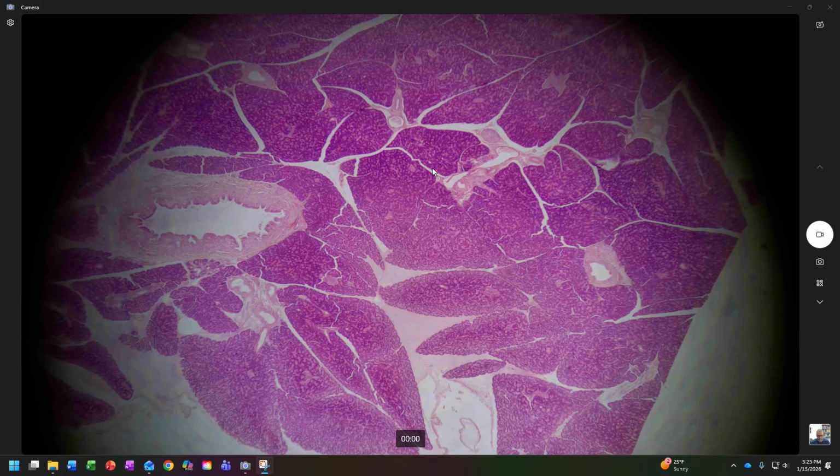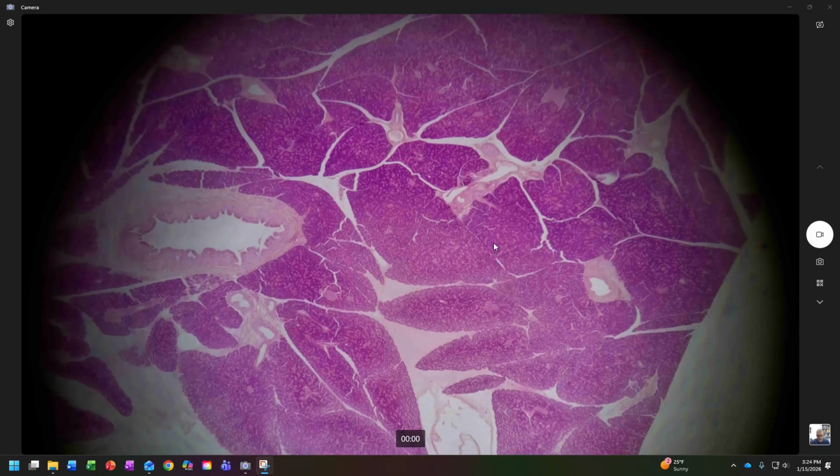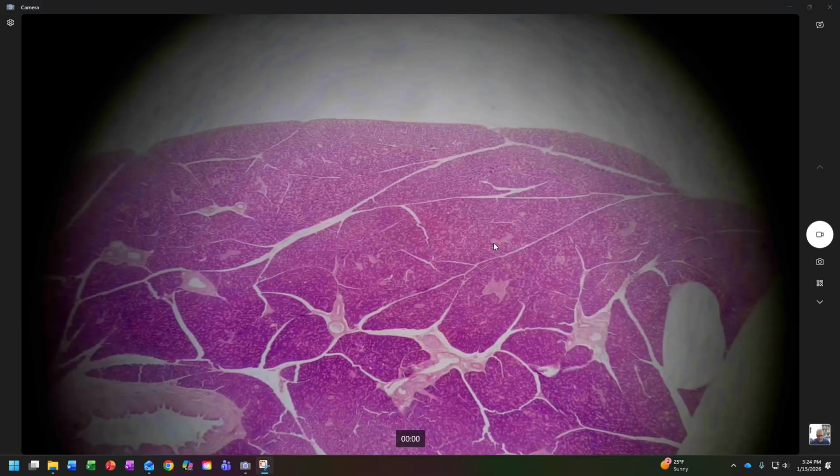But what I want you to focus on is really just the main darker area. That's all acinar tissue, and these lighter areas right here. Now, notice we've got these little light specks here. That's not what I'm talking about when I say lighter area. As we zoom in, what we should see, and I haven't looked at these yet, is that those little specks are going to be lined with acinar cells. At least that's my prediction. I haven't checked any of that yet, so I might be talking out of my rear end.